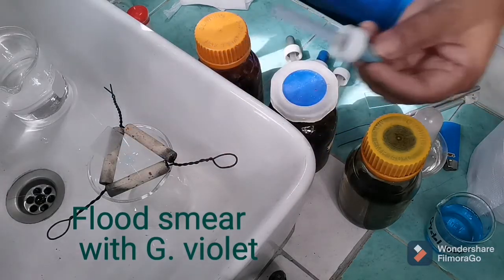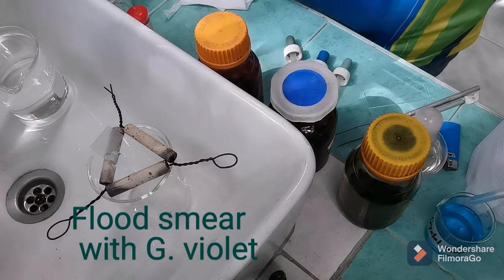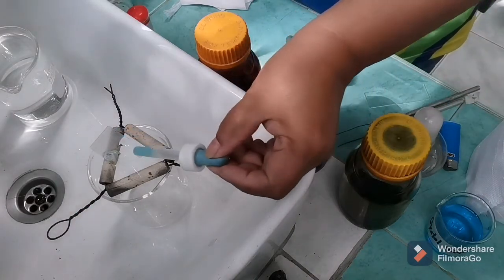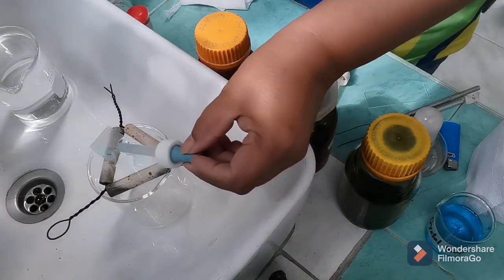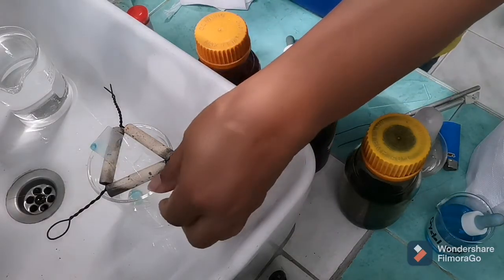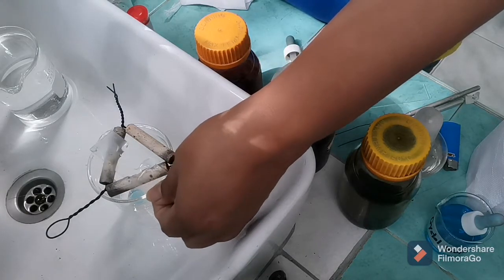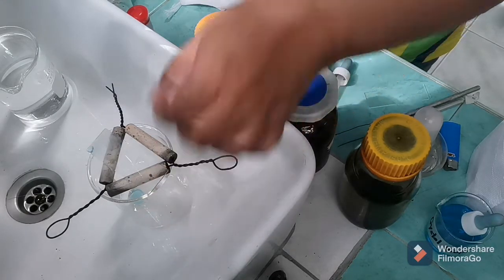So I could count 60 seconds. I could add more, but be sure to see to it that there is a stain passing through this smear. So this is only 1 minute or a 60 count.